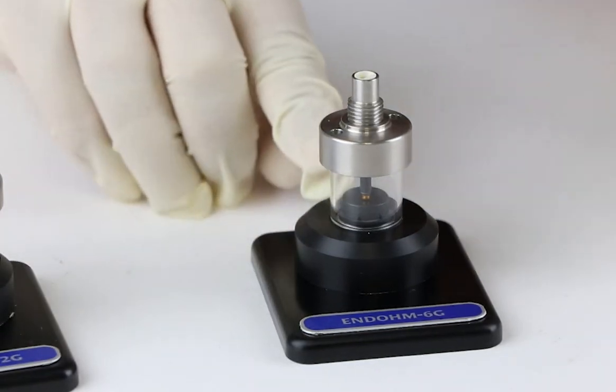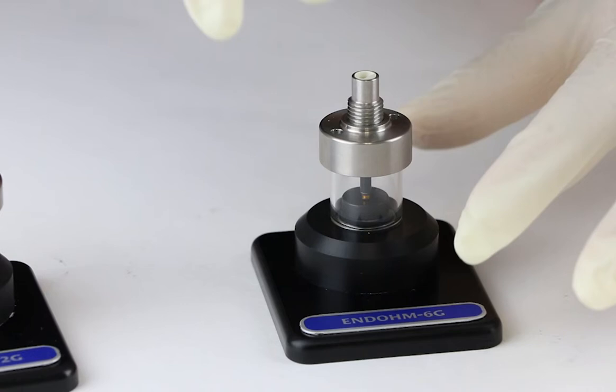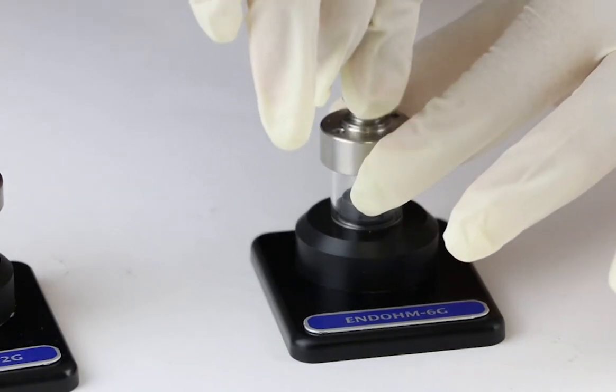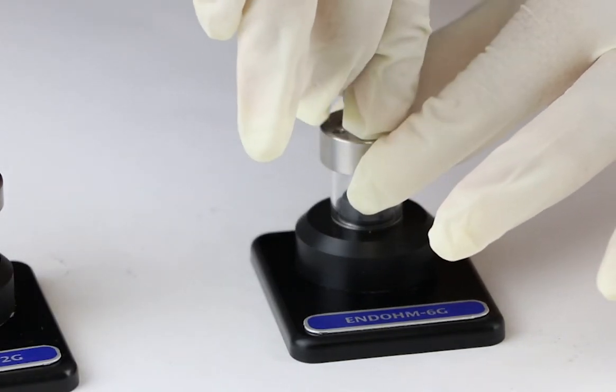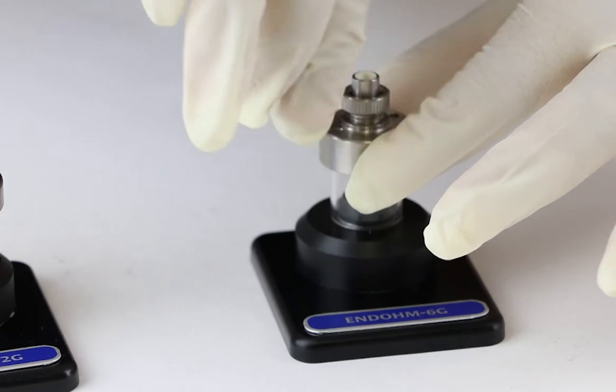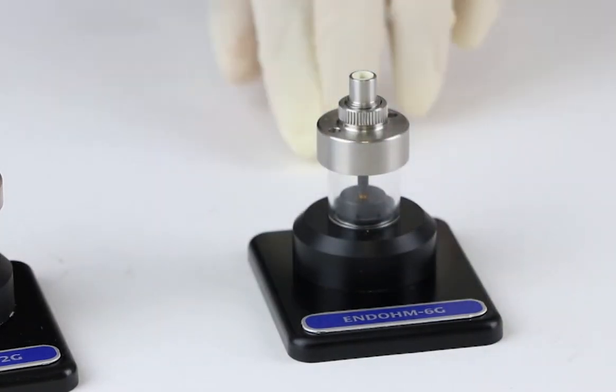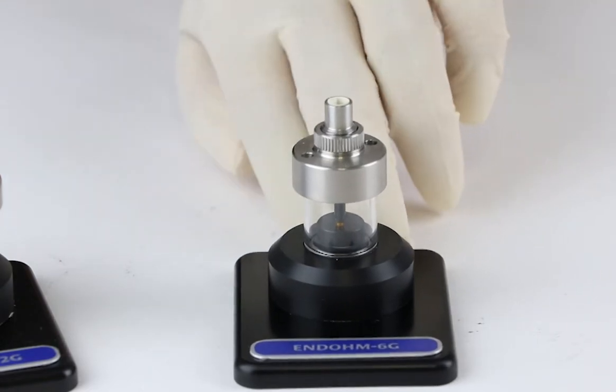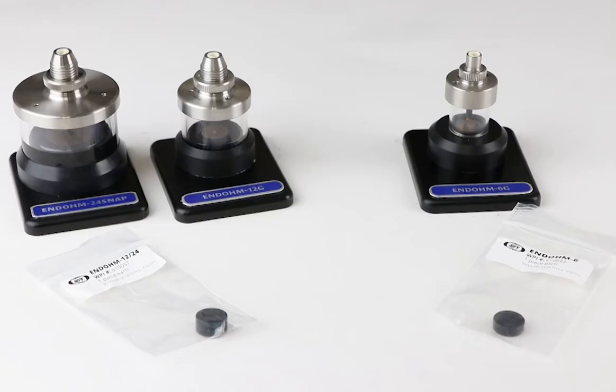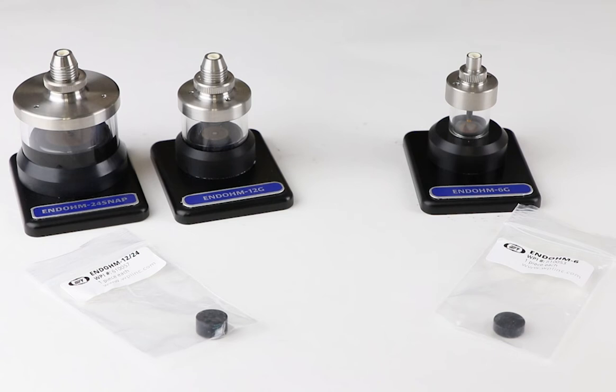Once the top electrode touches the spacer, lock the top electrode in place with the ring. Thus, using the spacer disc, you can maintain a consistent fixed distance of 4mm for endome 6G or 6mm for either endome 12G or endome 24 snap.